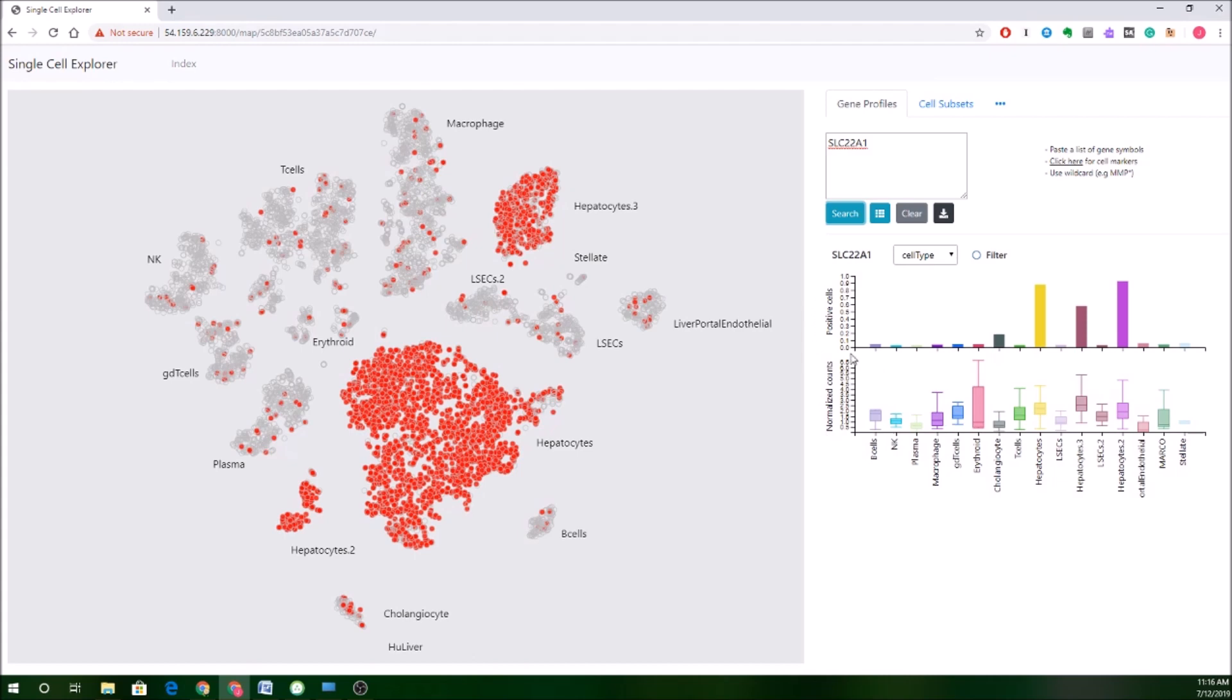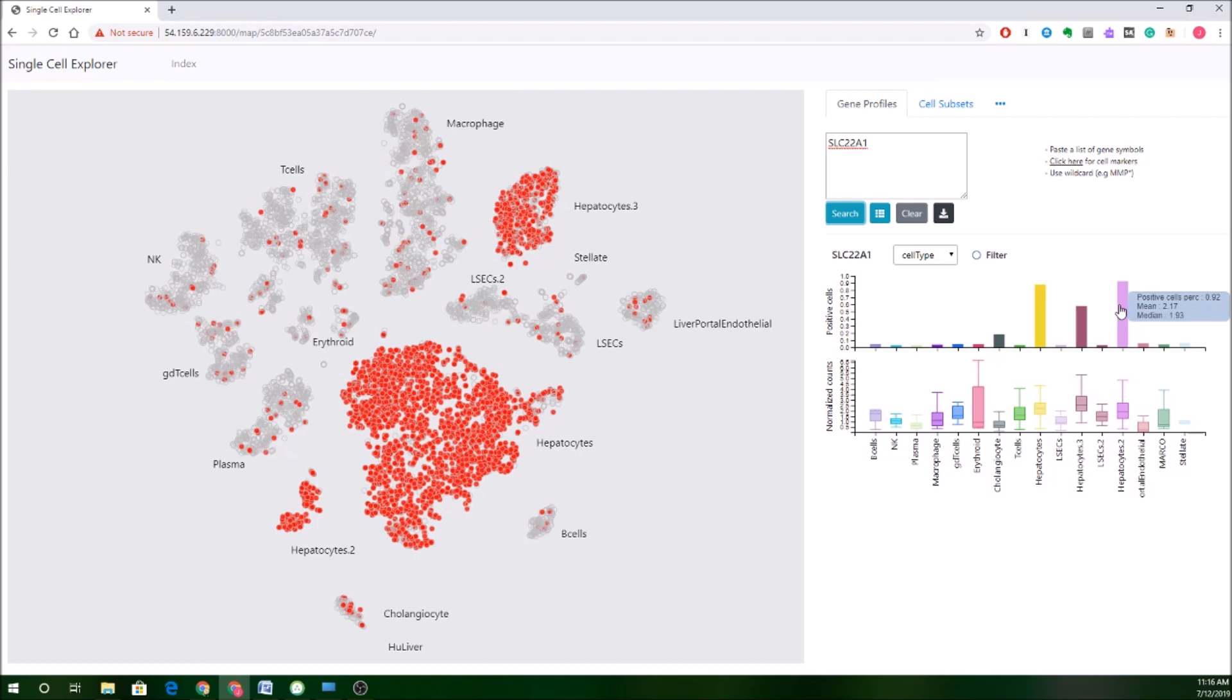You'll also note that to the right, you're getting some information in graph format about the overall expression of this marker. So you'll get the positive cells here. This is a percent by the different clusters. So you can see, again, good representation in the hepatocytes. And then you also get a measure of normalized counts. So this first one will show you how many cells in the cluster express it as a proportion. The second is showing you a little bit more about how much expression there is in the cells that express it.